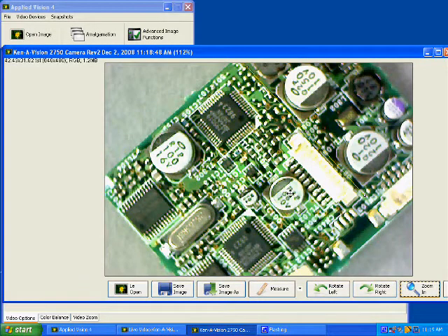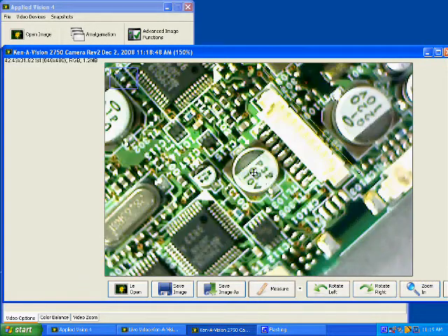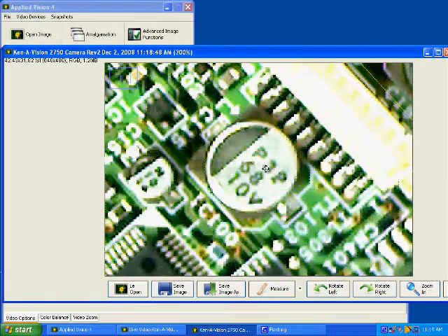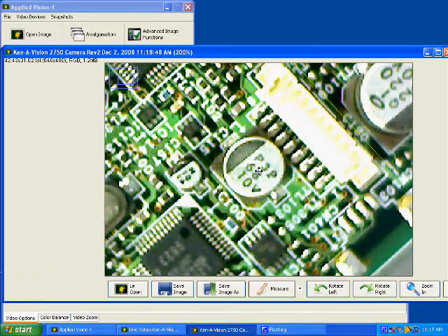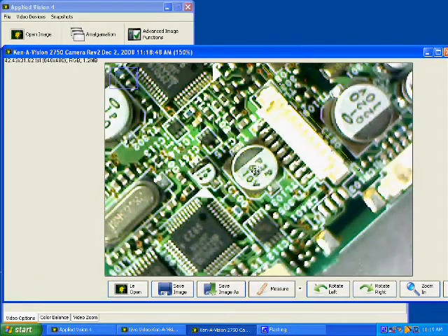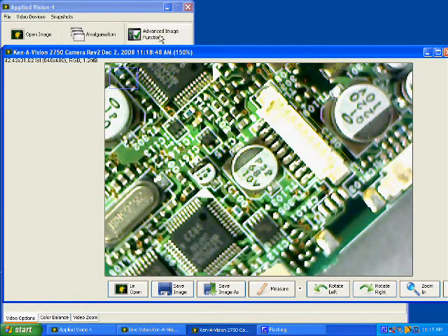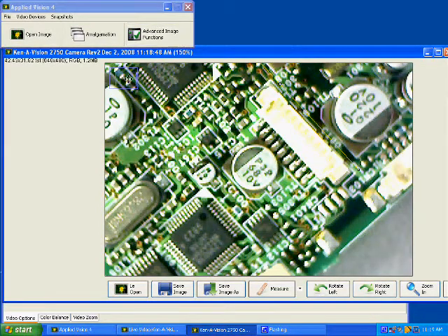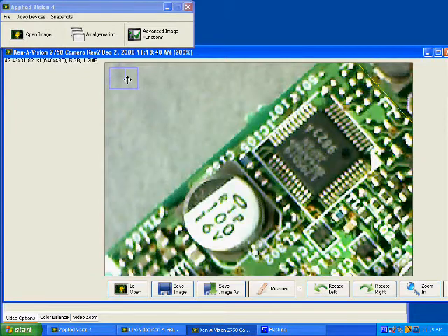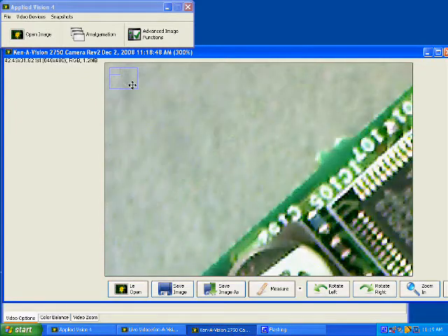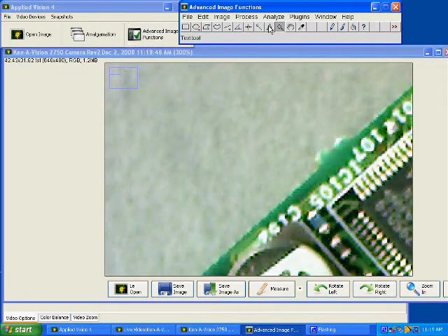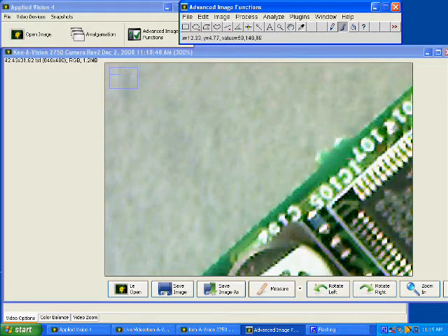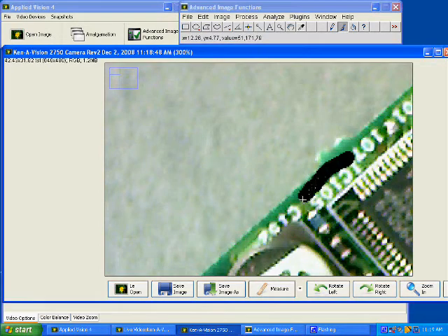Digital zoom functionality is included for still images as well. The advanced image functions provide a variety of editing and analysis tools, including standard painting and annotation tools.